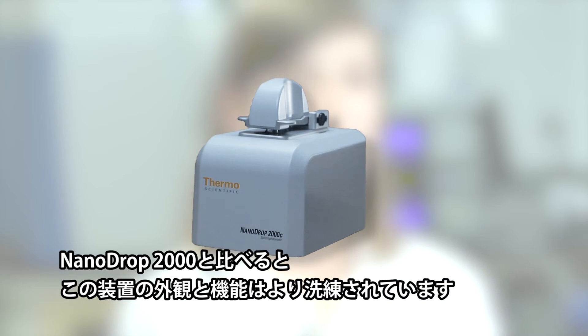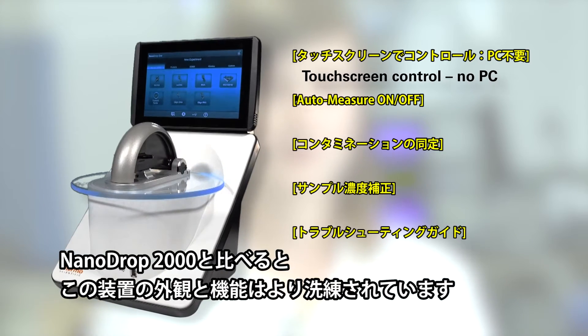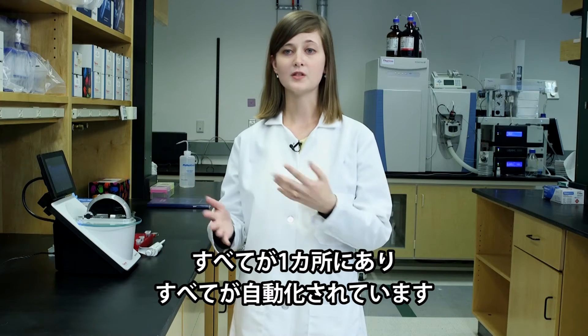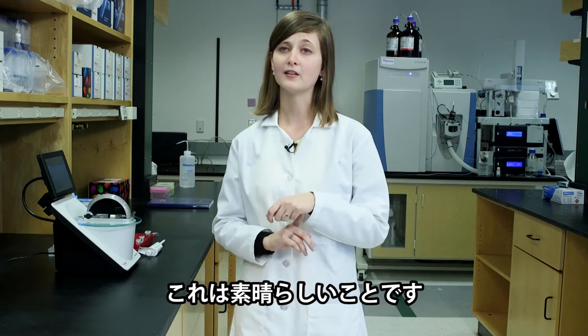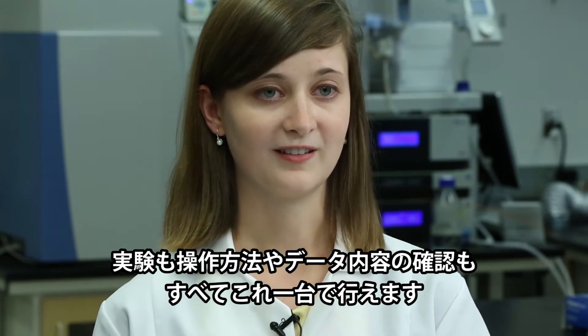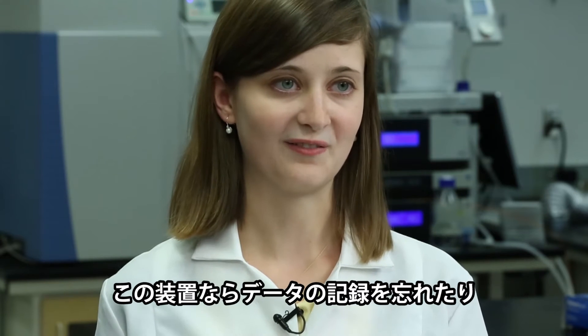Compared to the NanoDrop 2000, I'd say this machine is just sleeker in appearance and in functionality. Everything's in one spot. Everything's saved automatically, which is great. You end the experiment and everything's there — you don't have to think about saving it.